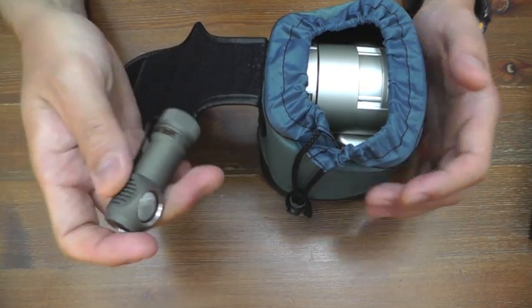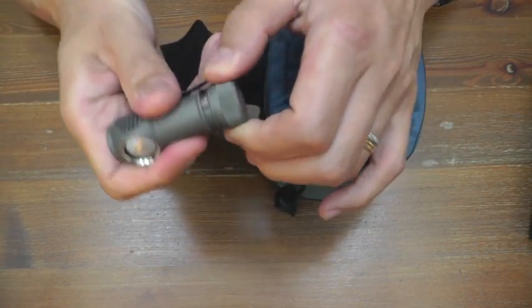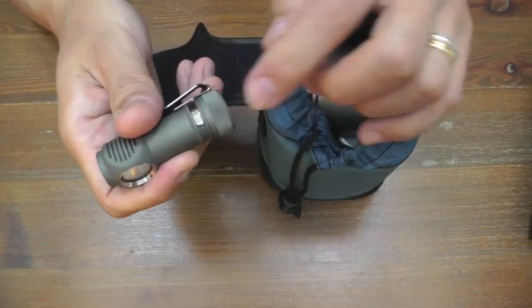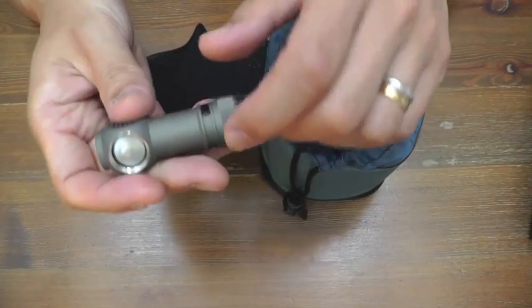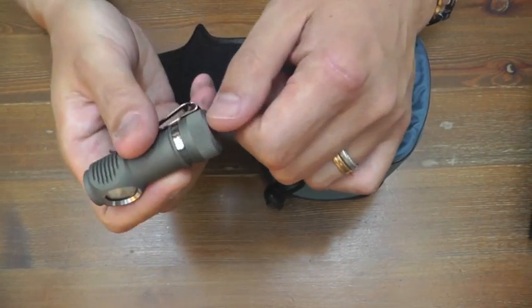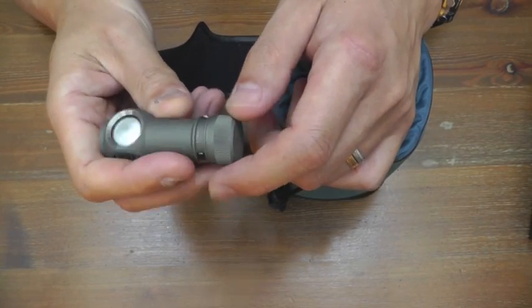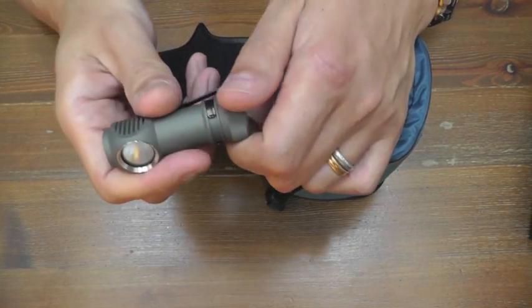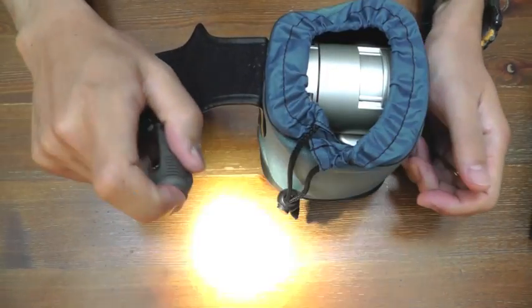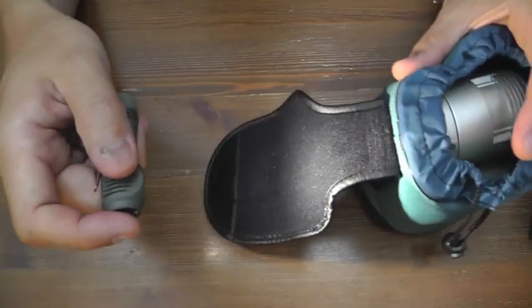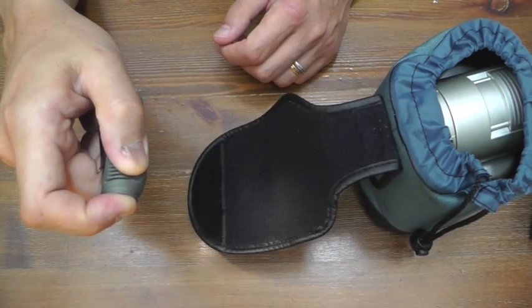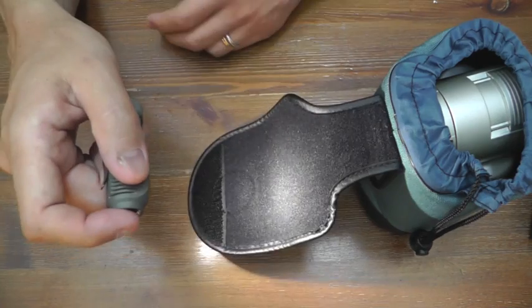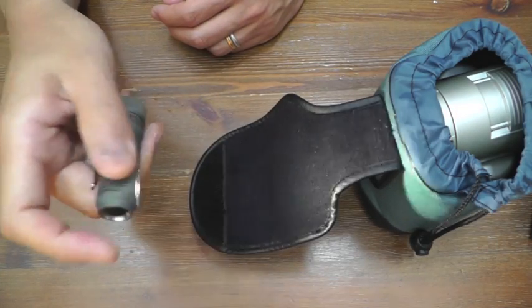Oh, I loosened the cap for safety. Loosening it prevents unintended activation. So it's bright. Three steps. Very useful. Middle will be good.